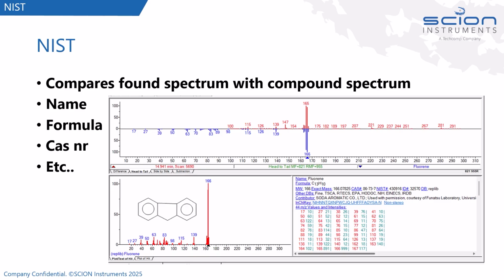You can clearly see that those are the most abundant ions. In the software, the quantifier and qualifier ions are usually chosen when making a SIM method, but you can always change this to your own preferences.